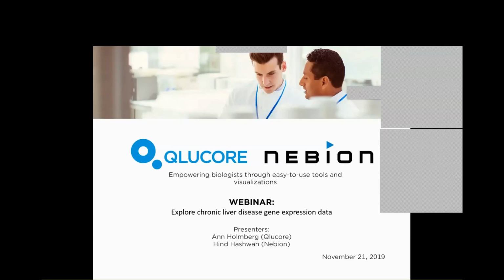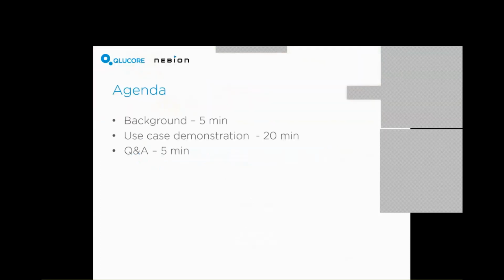And we will guide you through this webinar. The agenda is that we will give you a little background for about 5 minutes, and then we will do a use case demonstration using both our softwares in one common workflow. After that, we will have a Q&A session for about 5 minutes. Please communicate with us through the chat.